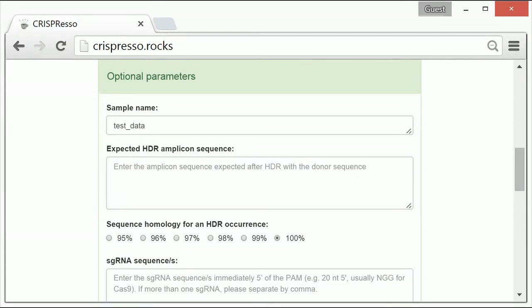The third option, sequence homology for an HDR occurrence, is a related option. This allows for the ability to set a threshold for sequence homology for CRISPResso to count instances of successful HDR.